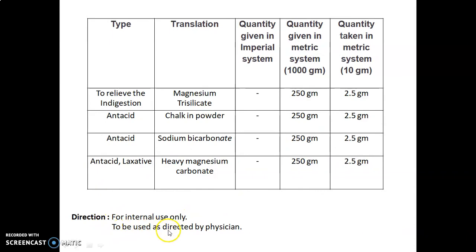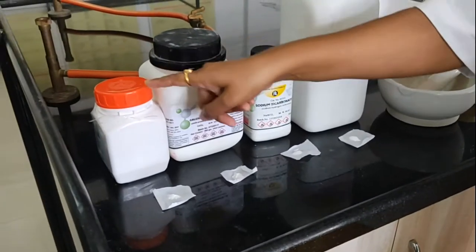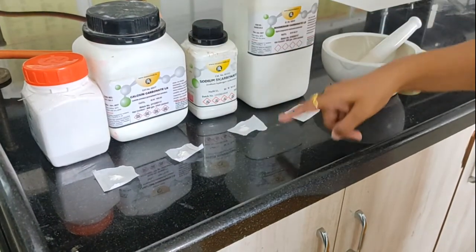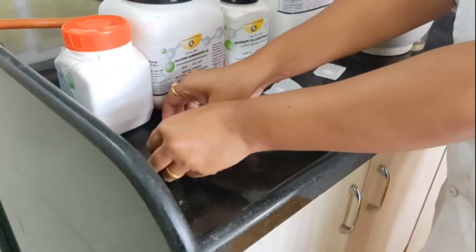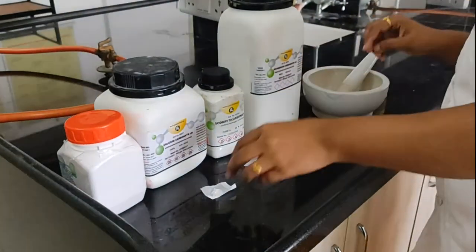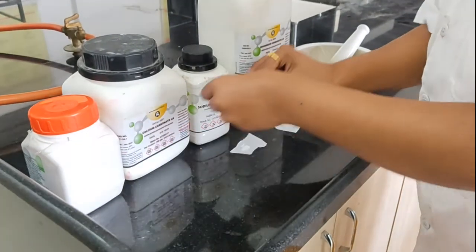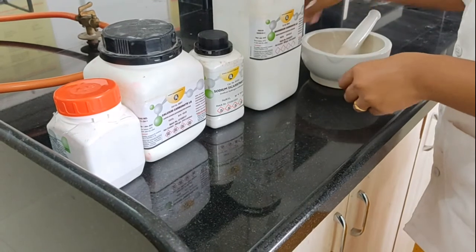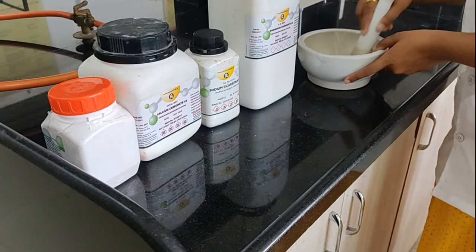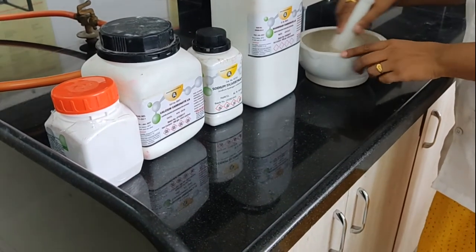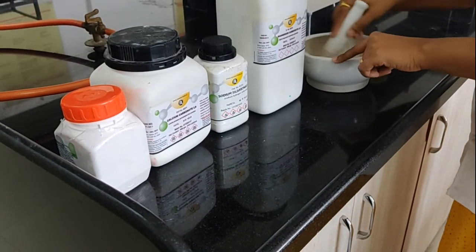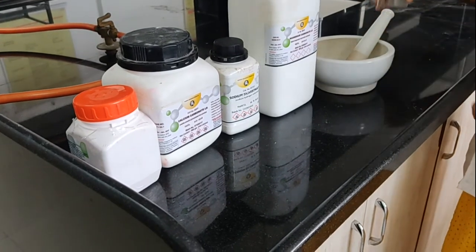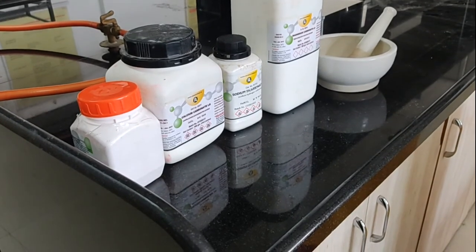For internal use only, to be used as directed by a physician. We have magnesium trisilicate, calcium carbonate (chalk powder), sodium bicarbonate, and magnesium carbonate. All four powders are transferred into the mortar for proper mixing, and trituration is carried out until all powders are properly mixed. After proper trituration, the powder is transferred into a wide-mouth dry bottle, and we proceed to the labelling part.